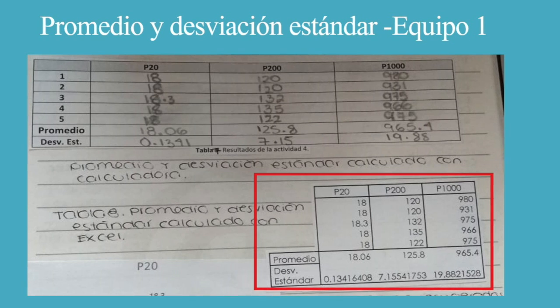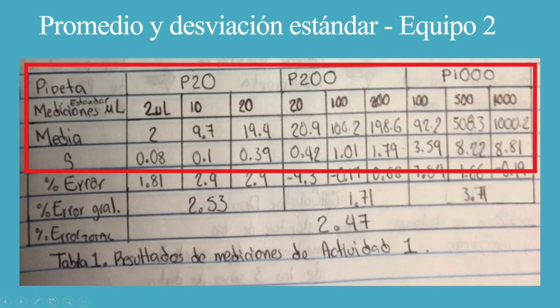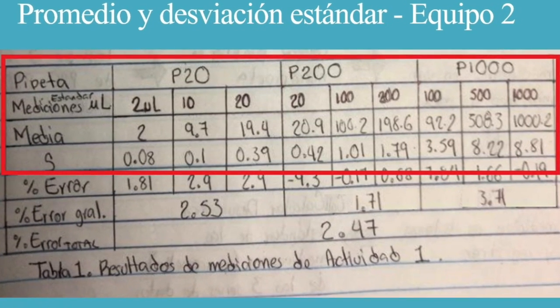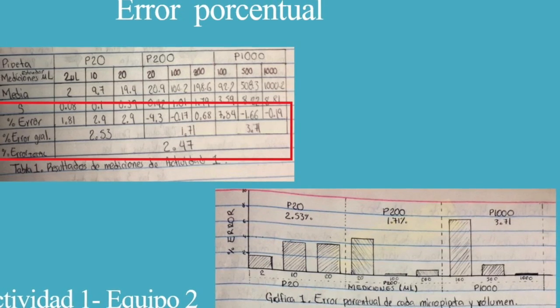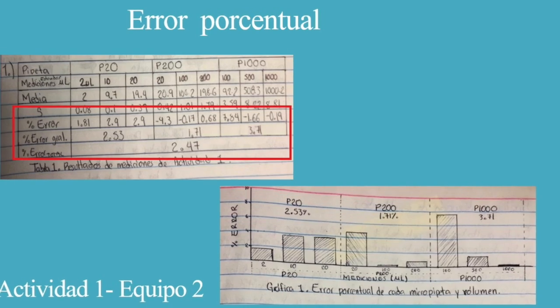The smaller the standard deviation, the smaller the dispersion of the data, which can be translated as constancy in the results. After the analysis of the data, it was observed that a measure was needed that would allow qualifying the pipetting technique in general.